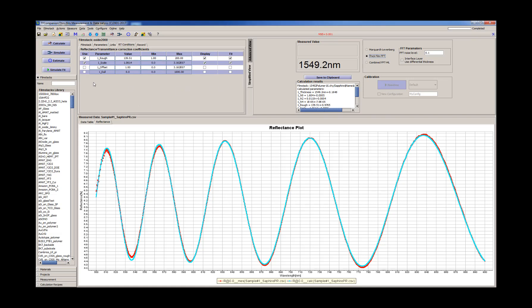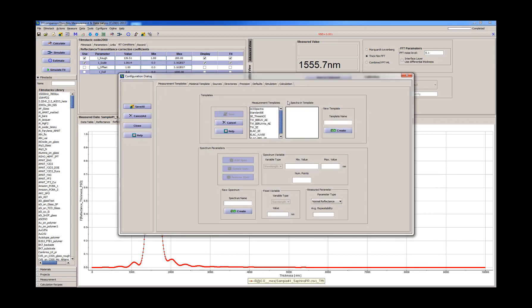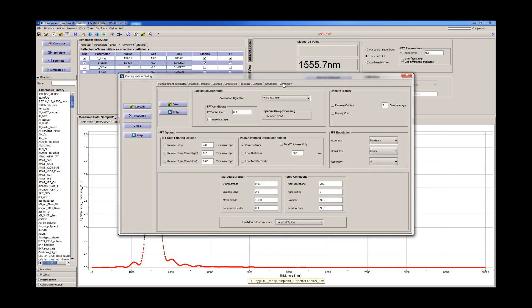Let's see what will happen if we use thick film algorithm. So the value is higher, about 5 nanometers. So we need to adjust this.